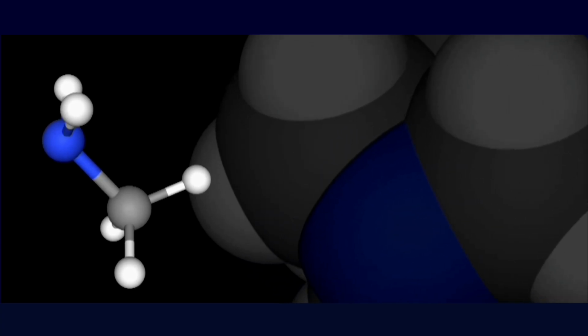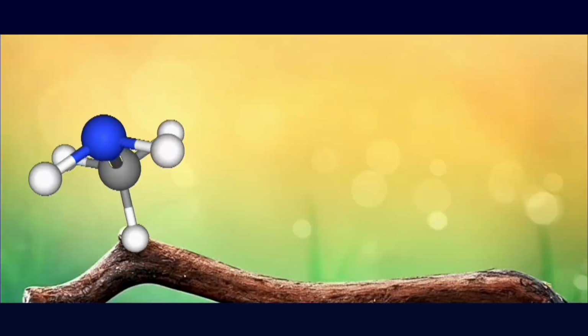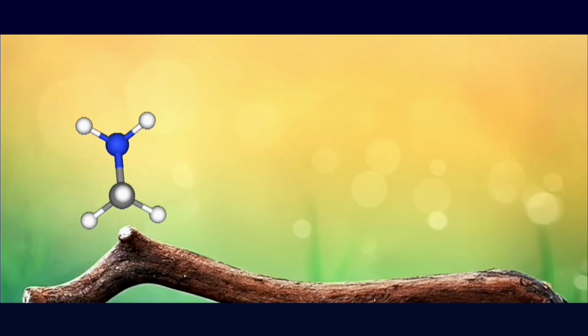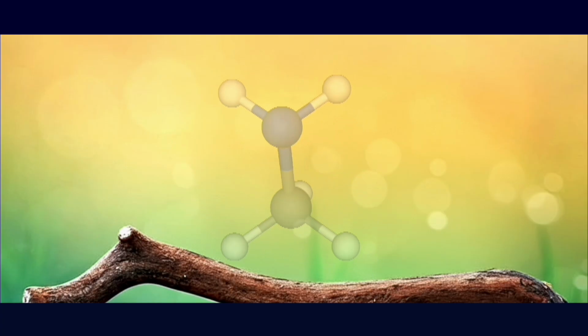Formalin boils at 96 degrees Celsius, meaning that at or above the boiling point of water, there will be unacceptable levels of formaldehyde loss. Formaldehyde will be key, as without its ability to reduce, our nitrogens will remain as the simpler ammonium chloride. Chemists aim for a temperature between 70 degrees and 85 degrees Celsius. This is both hot enough to break the cage, but also cool enough to retain reactants.